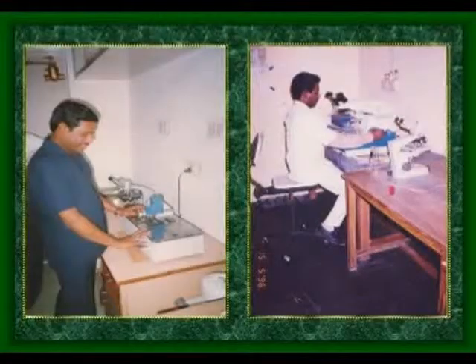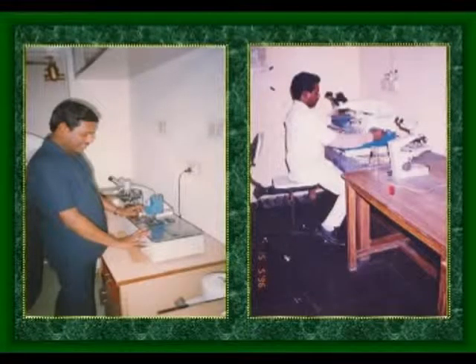After that, you want to make glass knives. For glass knives, Belgium glass strips are usually available. These Belgium glass strips first have to be broken down with the help of a knife scorer or knife maker. This knife maker will cut the glass first into a square, then into triangles.